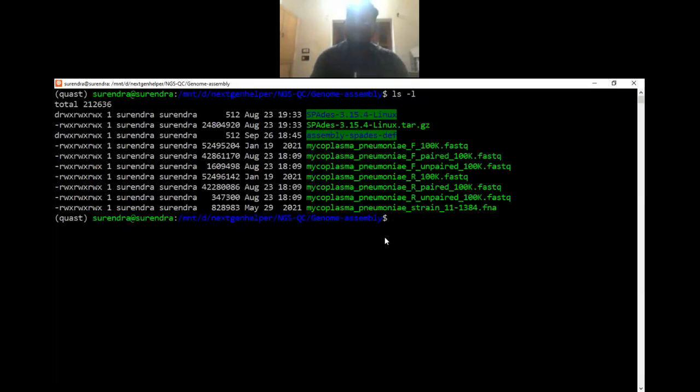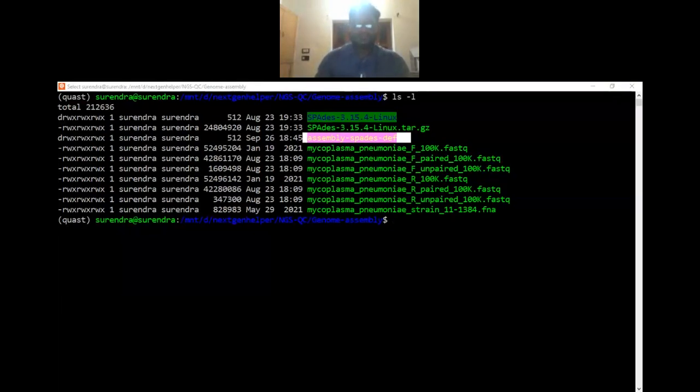Okay, so let's run the assembly. I have run one assembly here, the defined one. Let me show you both the commands. This is the defined assembly which I ran.